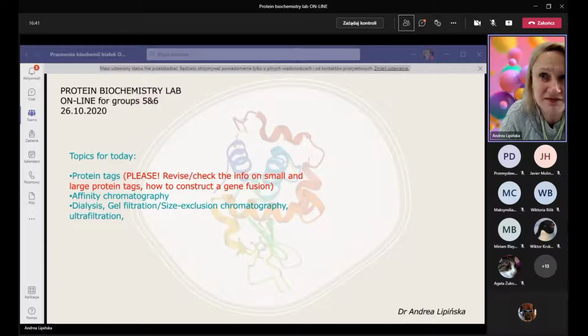There are also some specific applications, like, for example, we may study ubiquitination of proteins. For studies of interaction using also proteomics and mass spectrometry, there are specific domains which can enrich the analyzed material with our protein.